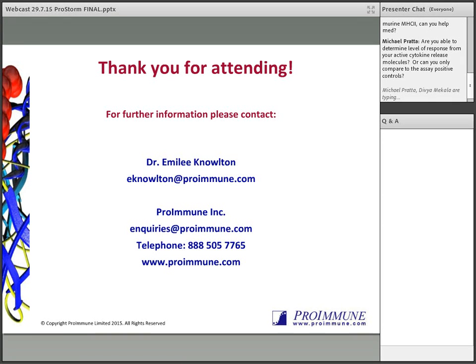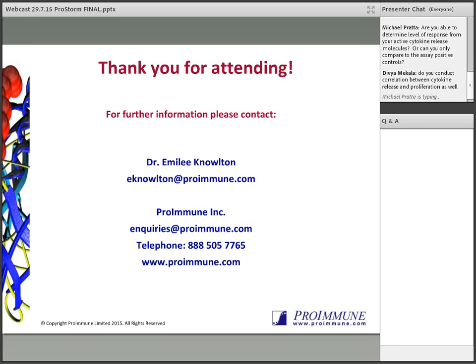Okay, so the next question. Are you able to determine the level of response from your active cytokine release molecules, or can you only compare to the assay positive controls? Well, what you get are the actual concentrations of cytokines that are being released into the plasma, but having those quantities becomes more applicable when you have something to compare them to, really.